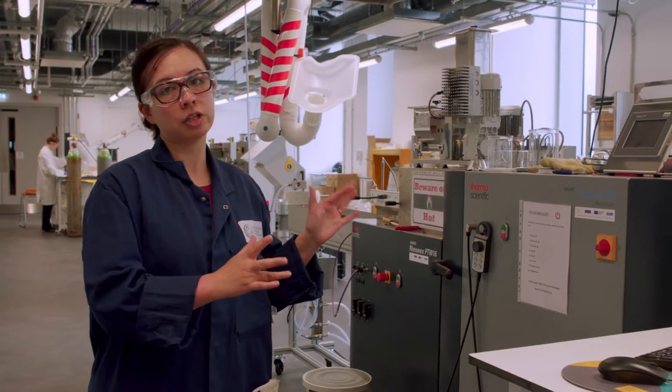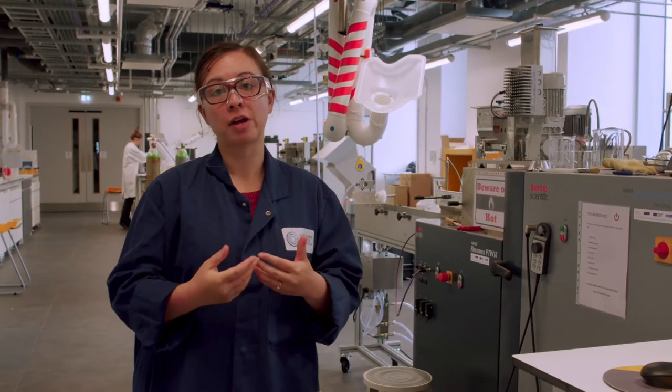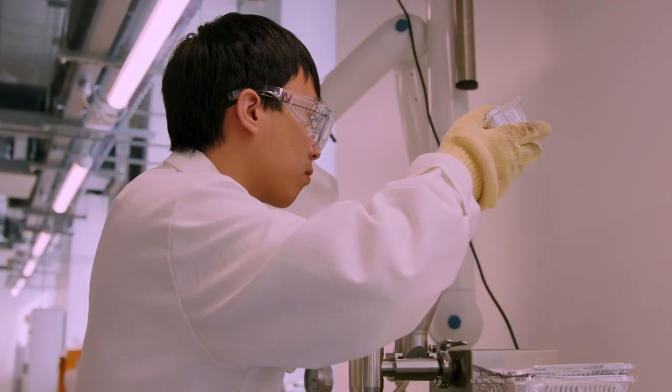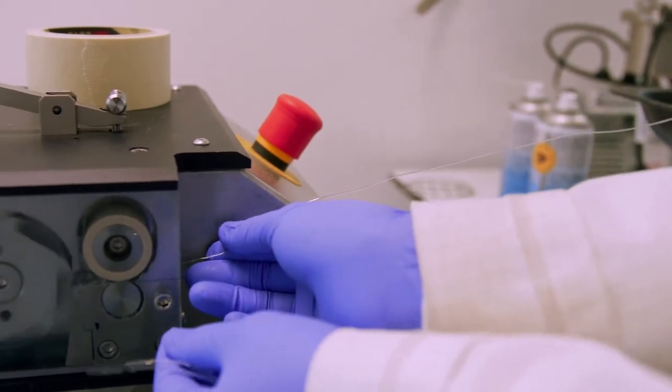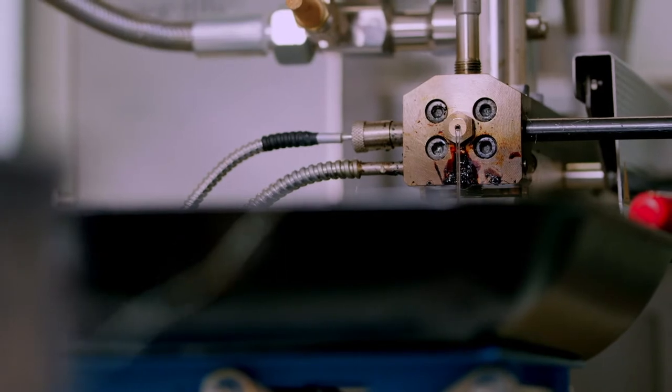Here are our extruders. One of the ways that plastics get recycled is by a process called mechanical recycling. So we can do all sorts with these. We can work out how many times the material can be recycled before it starts to fail or lose the properties that make it useful. And we can also mark plastics to work out how much recycled content there is.